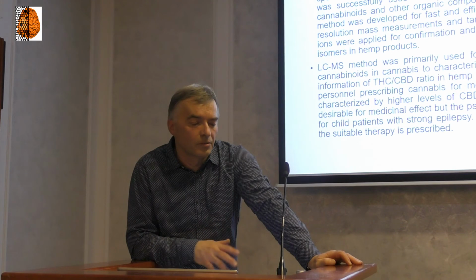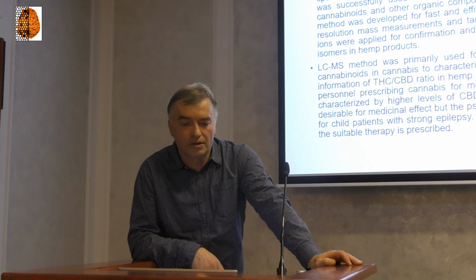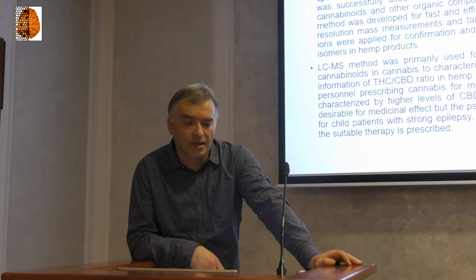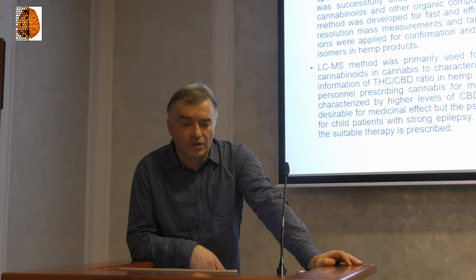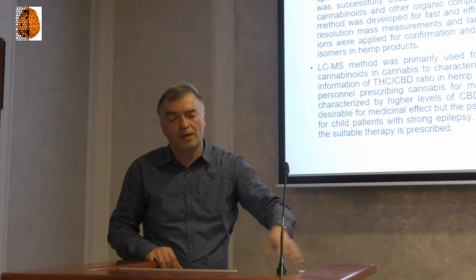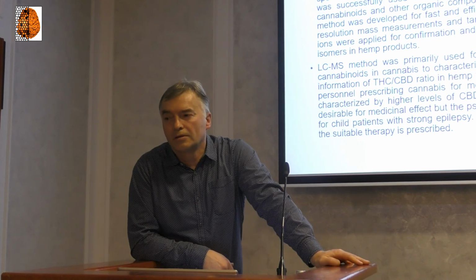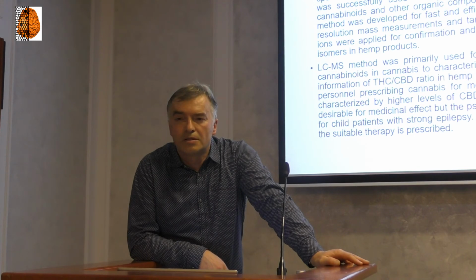We used our instruments mostly for detection and determination of environmental samples, traces of impurities or pollutants in the environment, and other laboratories which are more oriented on human samples maybe can also develop the method for these plasma samples and similar samples, or urine samples.